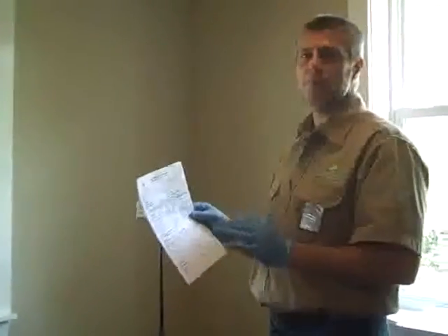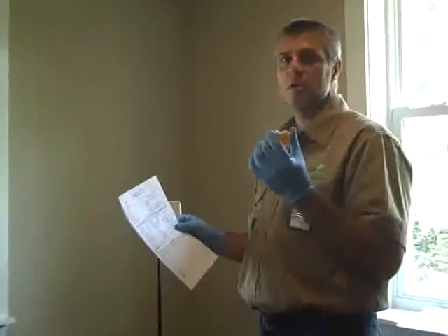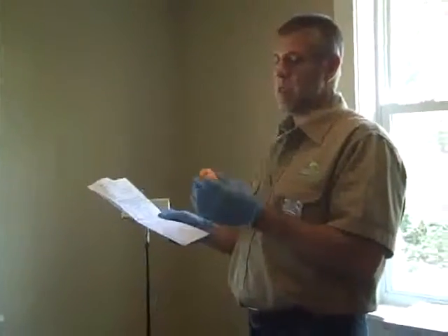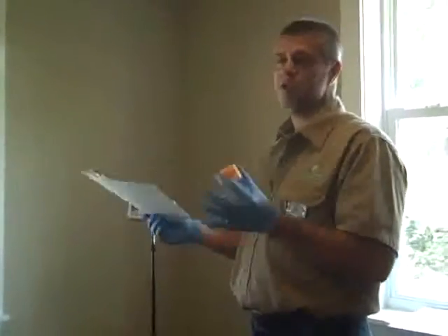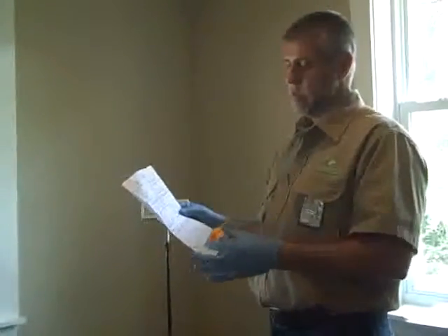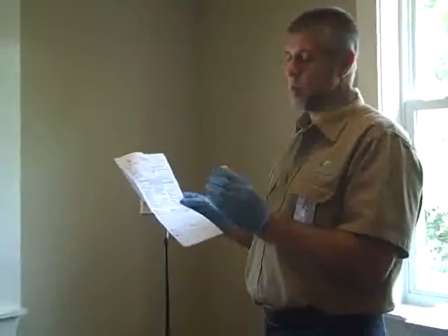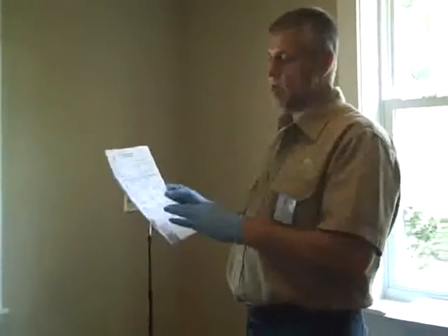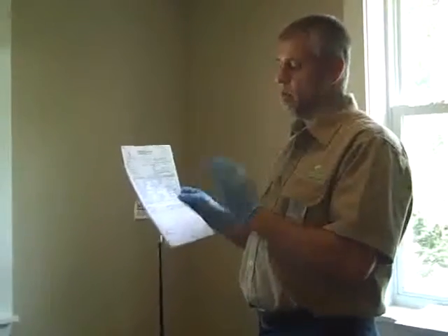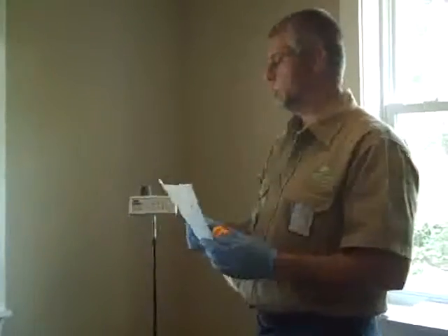Every time we do a sample, we have to fill out a chain of custody. And that is to correspond our cartridges with the rooms, so that when you send it to our lab, they can look at it and document it, so that if there ever has to be any legal involvement or any corresponding with second or third parties, we will have all this in place so that it corresponds and makes it all legal. So we will fill out all the information, the sampling areas, the type of method, and the volume that we use, depending on how clean or dirty the area is that we're going to use.